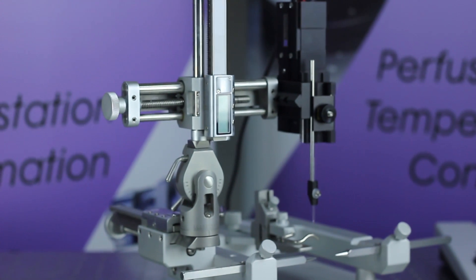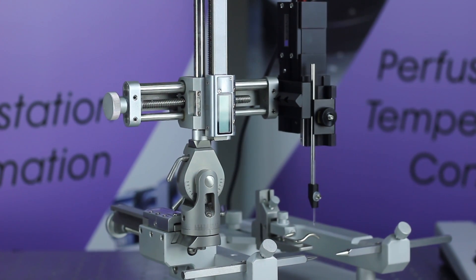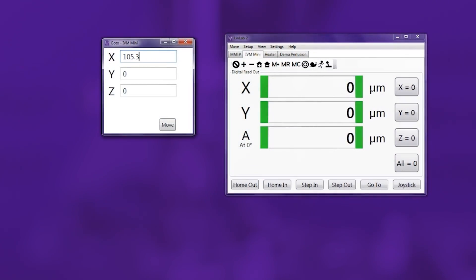The IVM Mini Single can be controlled by the Patchpad 1 or Scientifica's Linlab software. Use the software to control your device and customize a range of settings to your needs.